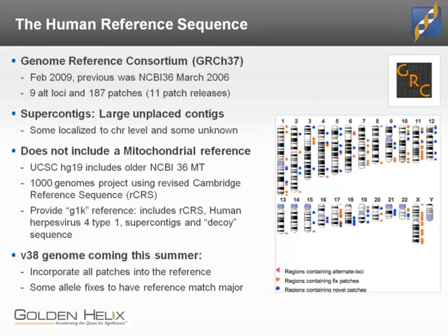One of the first major considerations you need to think about is your choice of reference sequence. Most of us are doing resequencing, where we're just sequencing data, aligning it to a reference genome. Most of the world right now is using GRCh37, which has been available since 2009. I would say it probably took about 2 years after that to really become standard. We're expecting a new genome later this year, and again, I expect it will take a while for people to really start using it, mostly because of all those annotations that we've already been talking about.